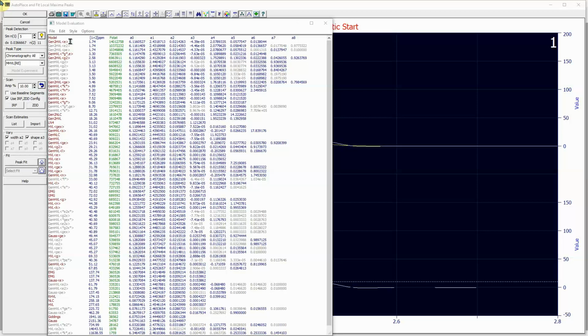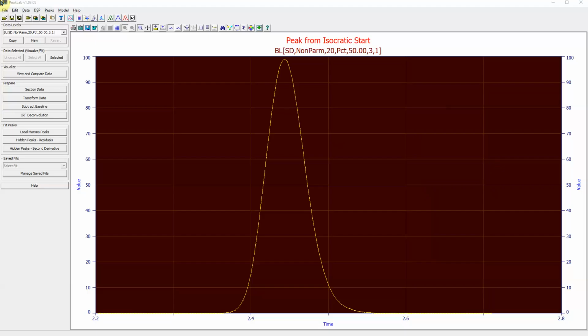In the model discovery procedure, the grayed models are those where the fitted parameters failed statistical significance, the probability of a parameter being different from 0. This is useful for seeing models that may be overspecified with too many parameters, or instances where the fitting may not have realized the optimal iterative solution. We will now use this information to fit this specific peak.